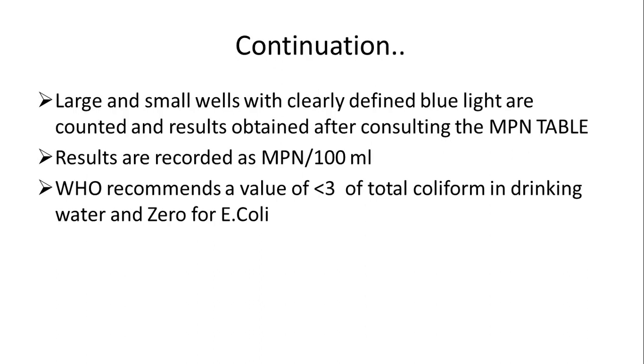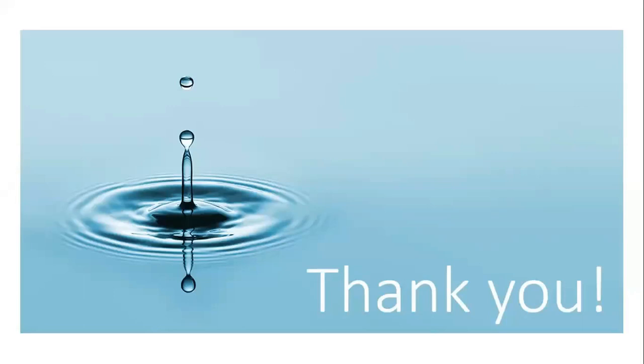As usual, you're going to compare the results with WHO standards and your country's standards. So WHO recommends a value of less than 3 for total coliform in drinking water and 0 for E. coli. I mean, you can't have water that has fecal bacteria in it. Next, let's do the next. Yeah, I think that's it.